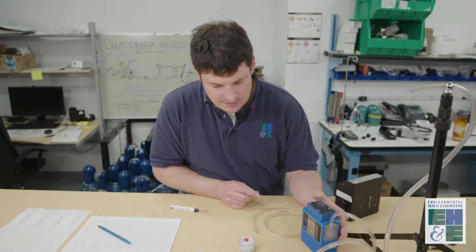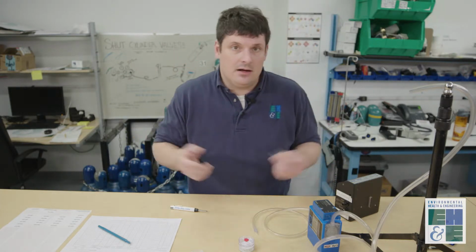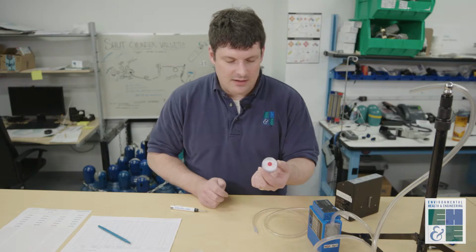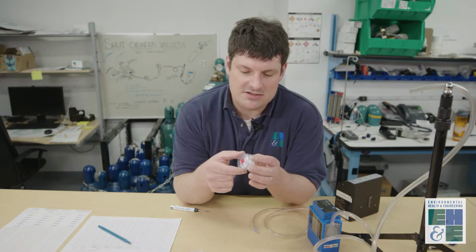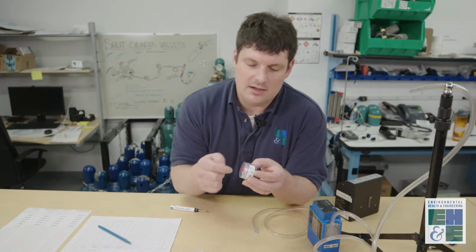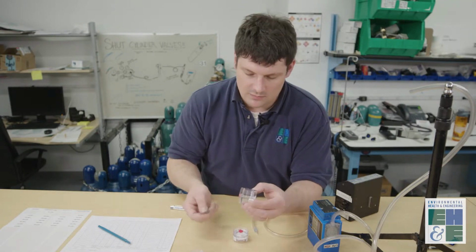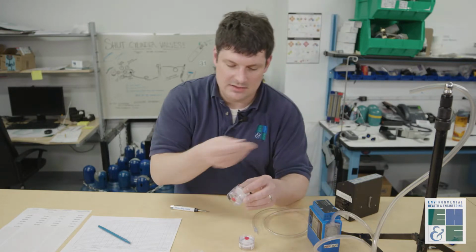So we're going to begin by setting our flow rate, which in this case I'll set at 1.5 liters a minute. So we're going to use these filter cassettes. Filters have obviously an inlet and an outlet. You want to make sure the direction of airflow is appropriate and passes across the filter. You can see the filter sits right here in the cassette. In this other cassette, this is a 3-piece cassette, it sits right here. Regardless, we want to be sure that the airflow goes across the filter and into the pump.